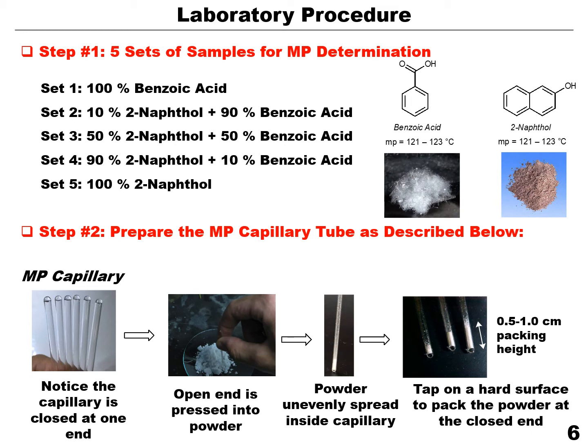So what we were doing back in school was, preferably, you can find a long stem funnel, and you can put the funnel with the big mouth facing the table, and you can then let go of the capillary tube through the narrow mouth of the funnel, and you can do that repetitively, and you will have the sample packed perfectly in the capillary tube.